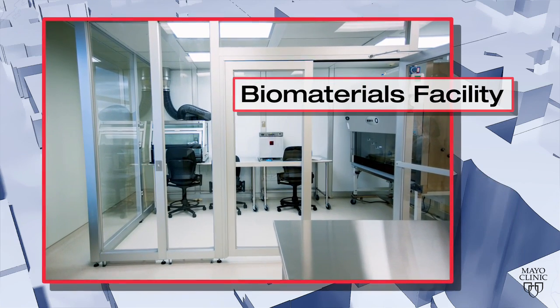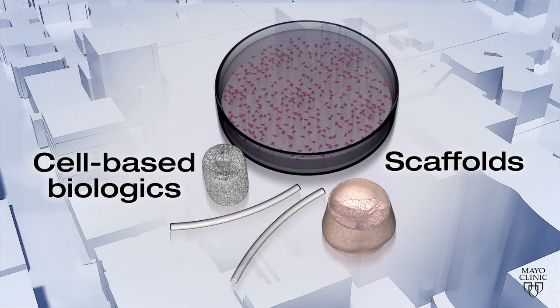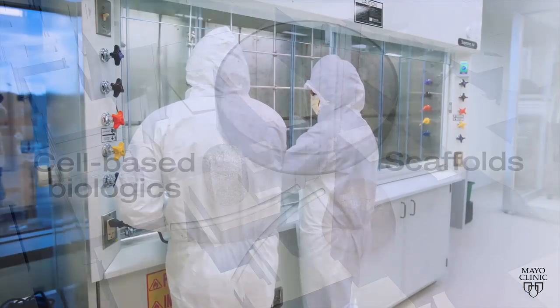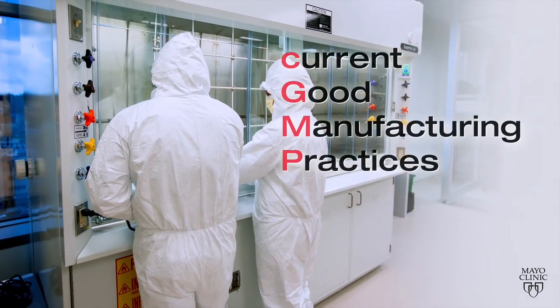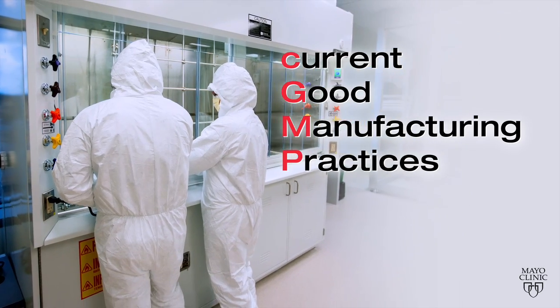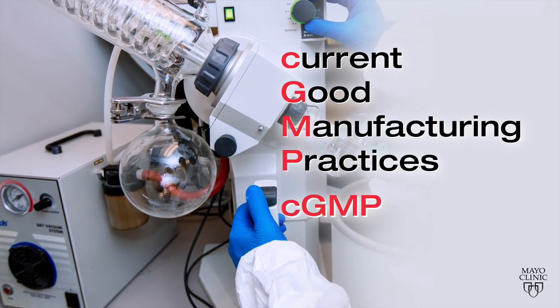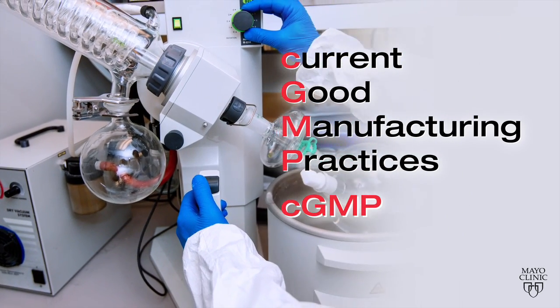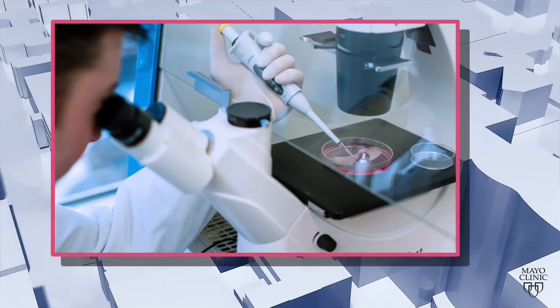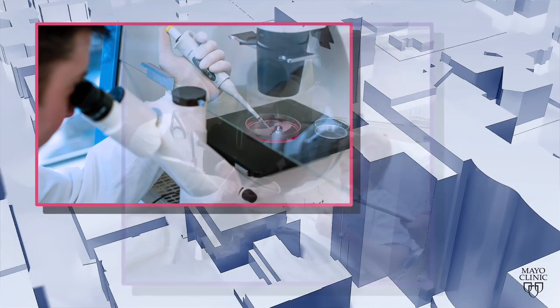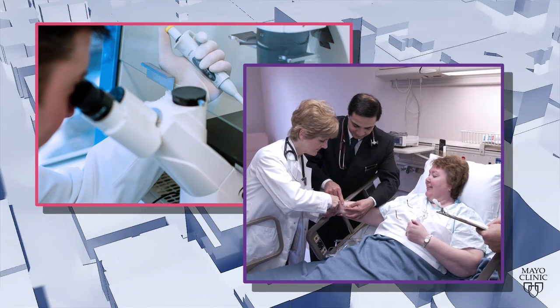The Biomaterials Facility will manufacture scaffolds that can be combined with cells from the Human Cell Laboratory in a clean room under the rigorous guidelines of current good manufacturing practices, or CGMP. Following CGMP accelerates the rate at which biomaterials and regenerative technologies are translated from bench to bedside.